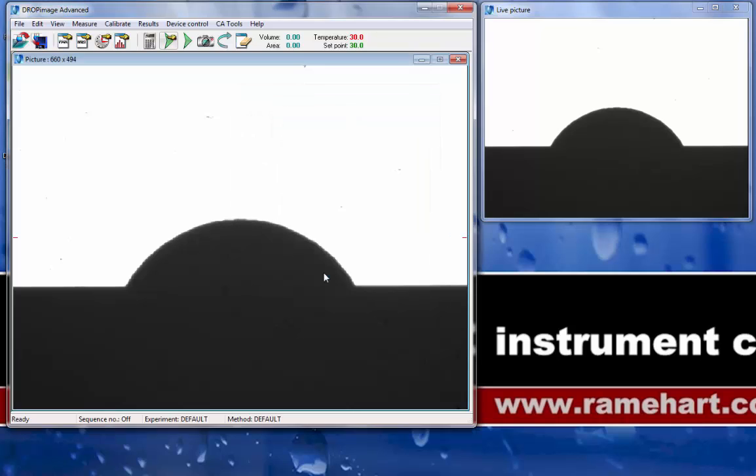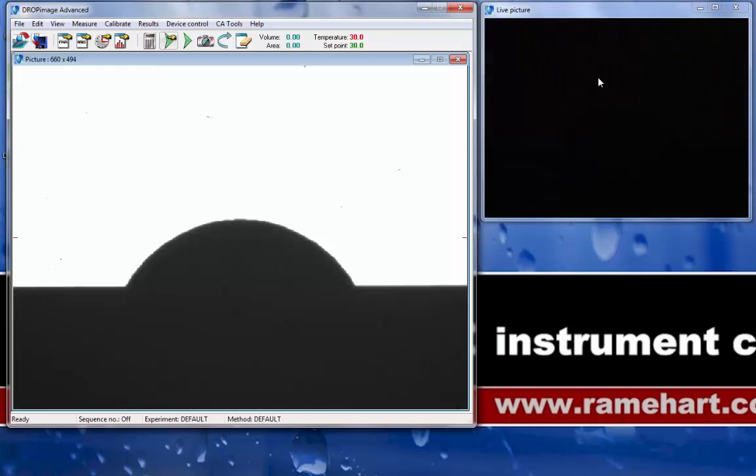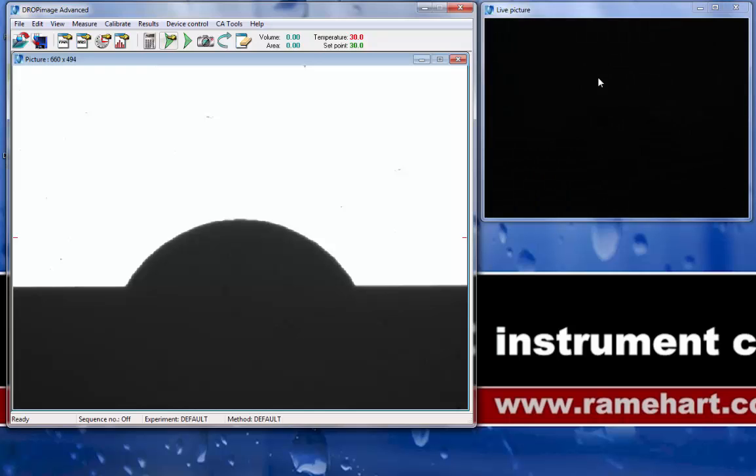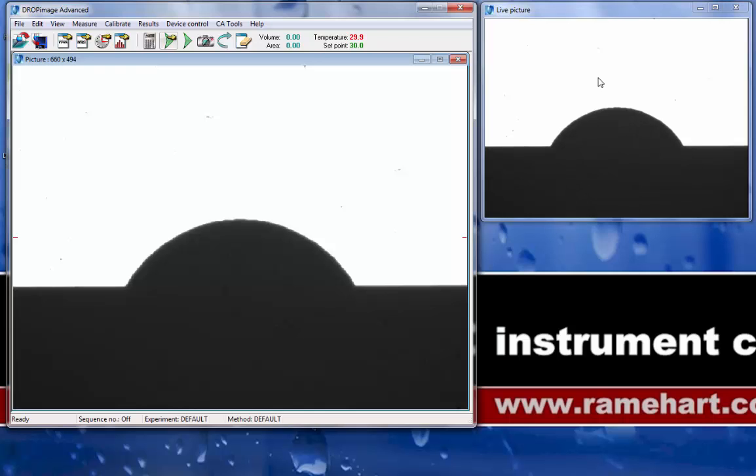By default, Drop Image Advanced uses two windows. The window to the right is the live video, which updates real-time. I am passing my hand in front of the video camera to show it update, whereas the video window on the left is a static video window.